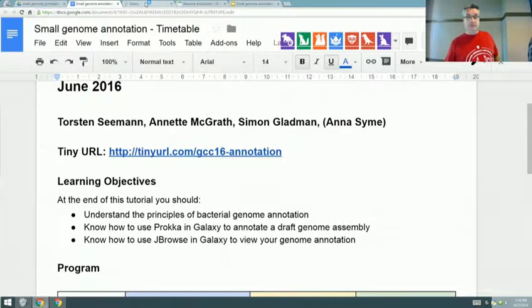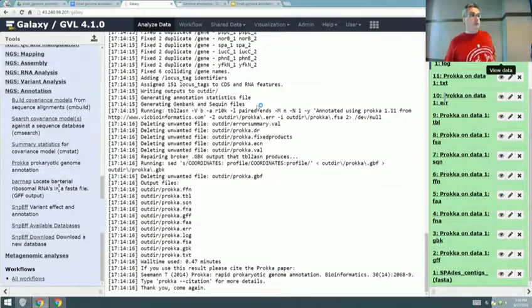Yes, the bane of my existence is that error that you just got. A few other people got it too. Well, then that means they didn't follow the instructions exactly correctly, because it tells you to change a couple of things to single letters. If you don't do it, you'll get the error.